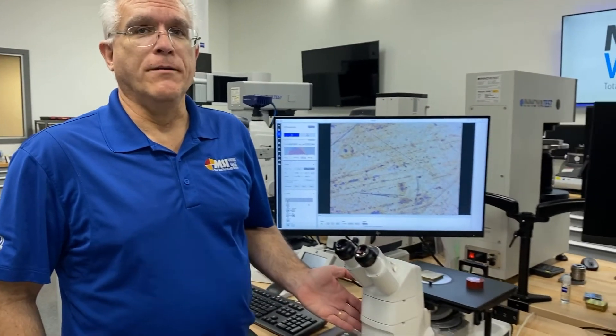Hi, I'm Mike Jones, Materials Specialist at MSI Viking. This is the Zeiss Axio Vert 8.1 Materials.